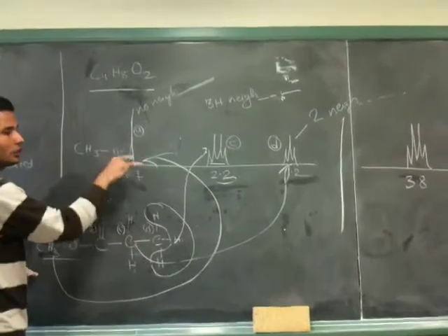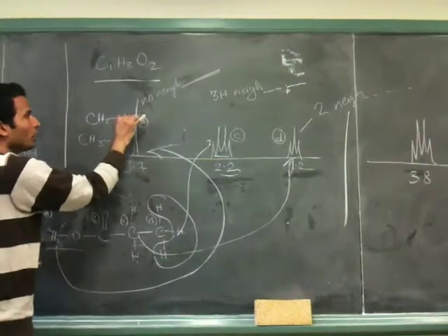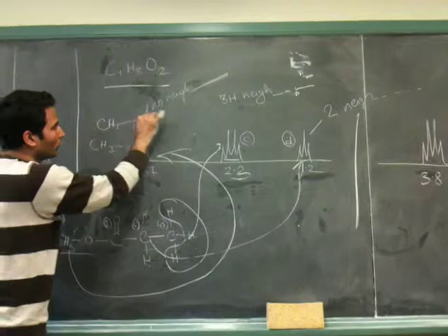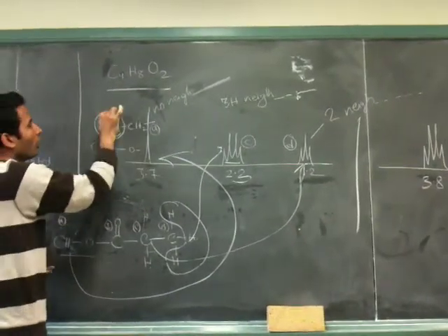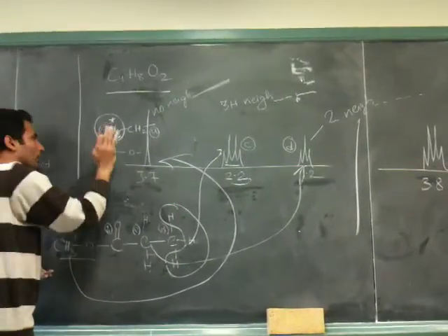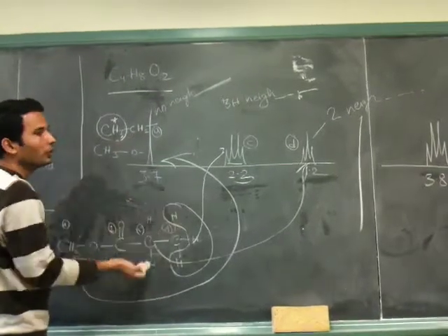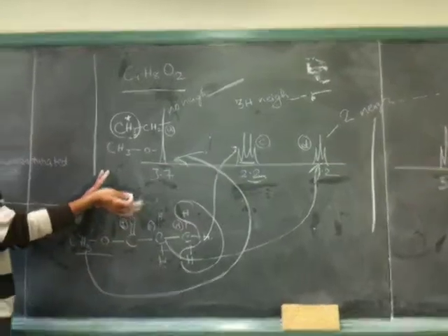If you have to write CH3, CH2, write CH3, CH2. Now there is confusion about which set of protons you are talking about. So you will say CH3, CH2 and make a circle or indicate it otherwise so that I can understand you are talking about this one, which is near the CH2, and I can look it up in your structure. Just avoid a mess on your graph.